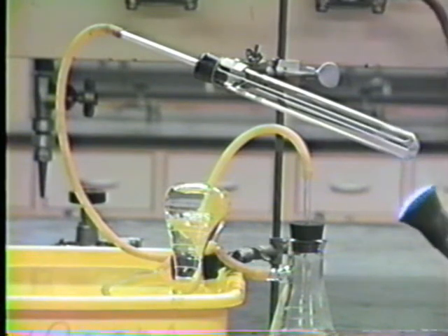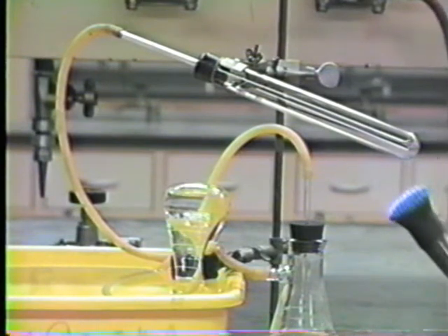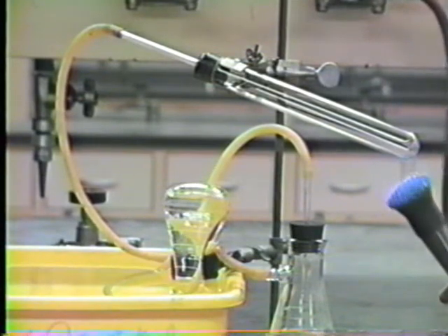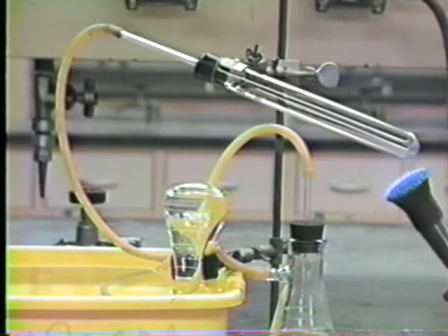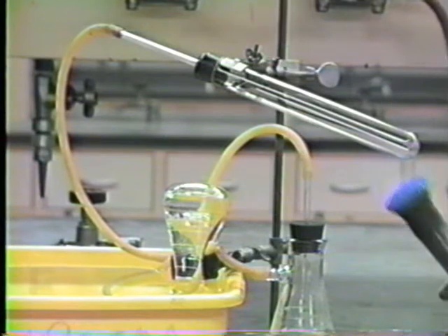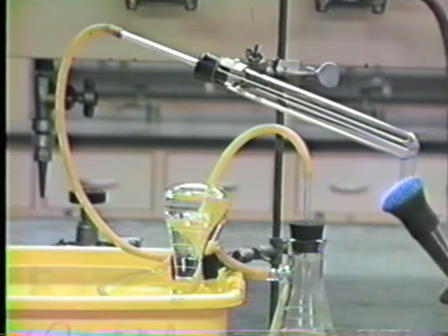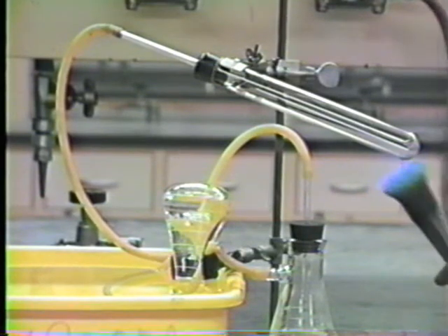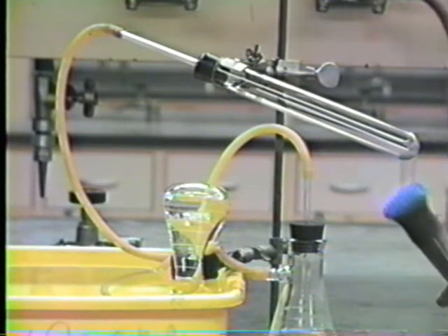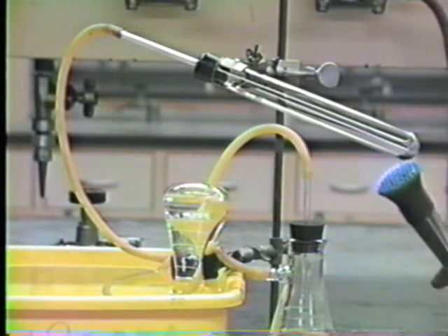Now we start heating it. Heat it fairly gently at first. The first thing that's going to happen, you can see that there are bubbles coming up into the flask there. That's because we're heating air and the hot air is expanding. So far we haven't generated any oxygen yet. The bubbles that you see coming into the flask over here are all just from heating the tube and expanding the air. Now we're getting melting of the potassium chlorate, and the manganese dioxide is starting to catalyze generation of oxygen.